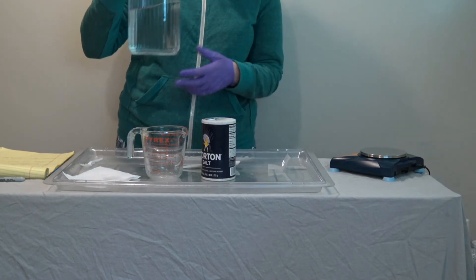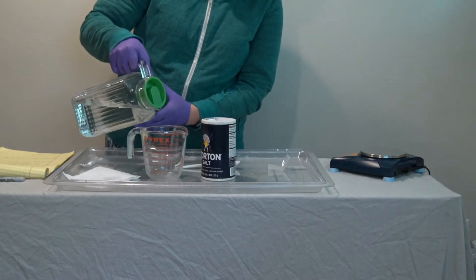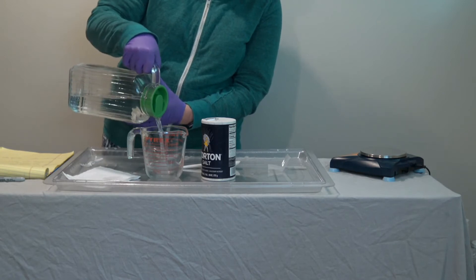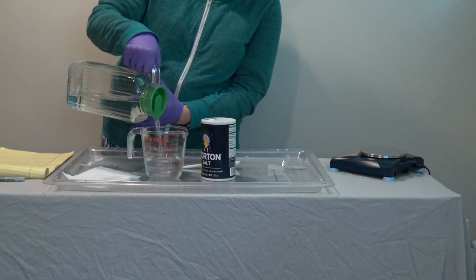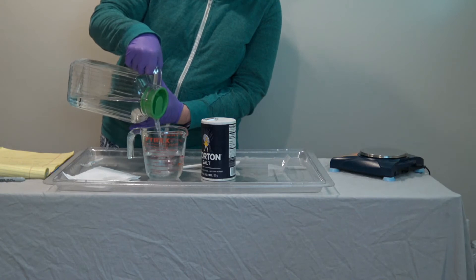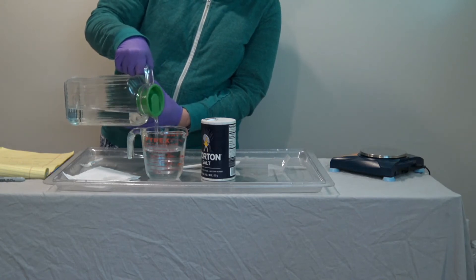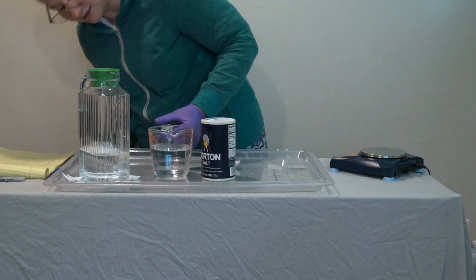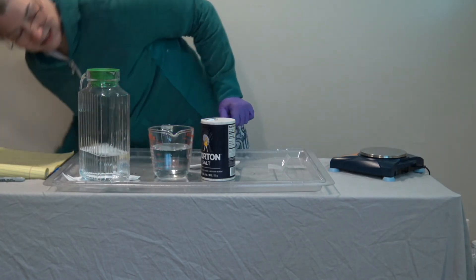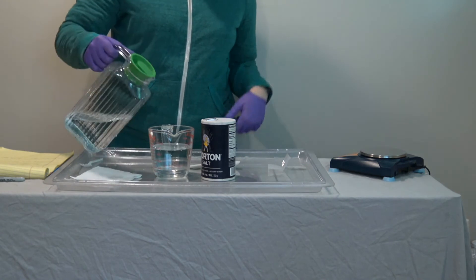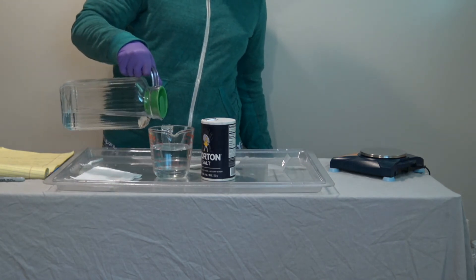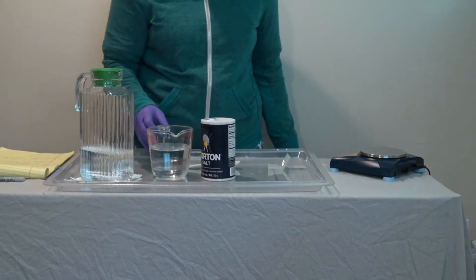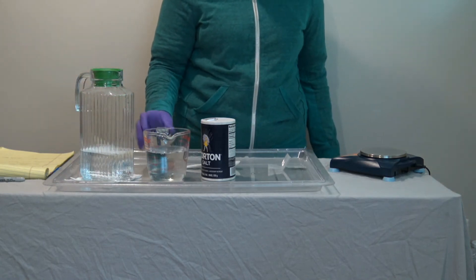Pour 400 milliliters of water that has fully come to room temperature into a measuring cup. You can use a graduated cylinder to measure it, or you can weigh it on a balance. 400 milliliters of water should be 400 grams. So I have my 400 milliliters of water.